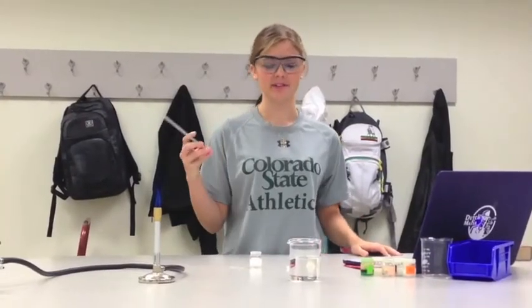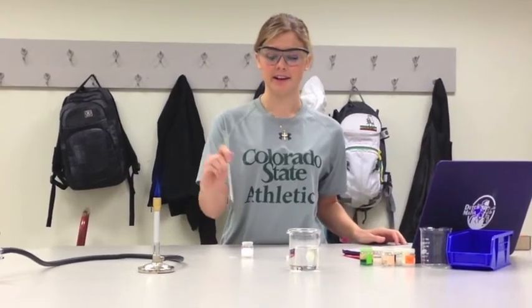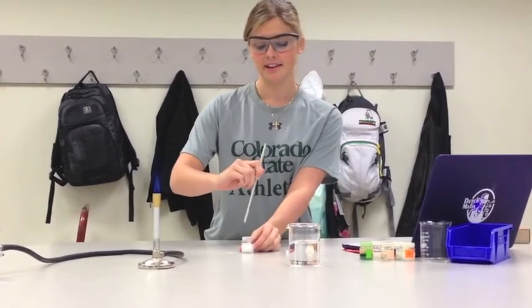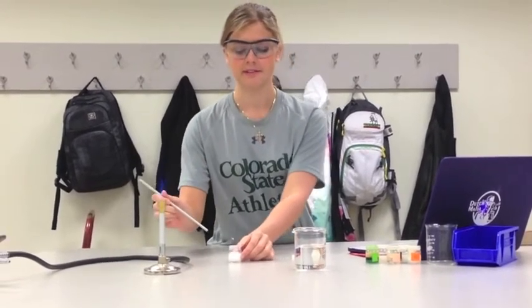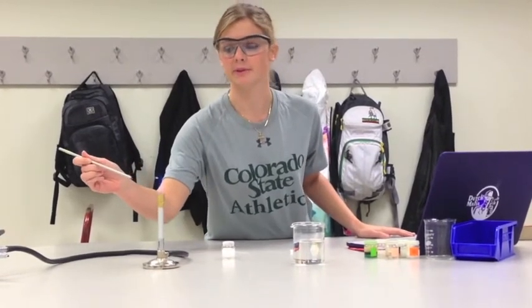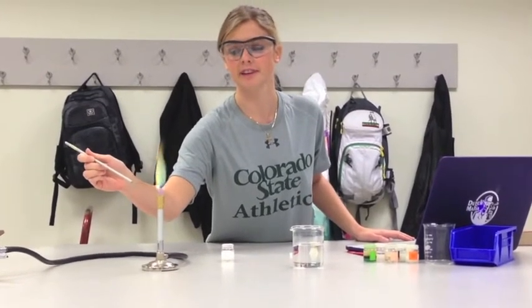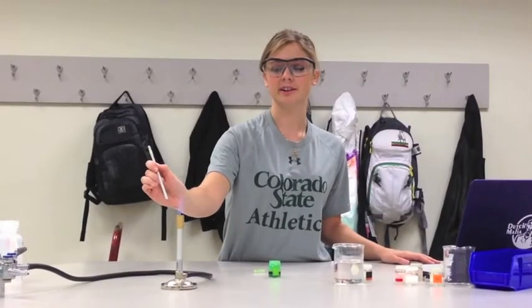Once your wire is cooled down, take your unknown salt and dip your wire into the unknown salt. Make sure to get it as best coated as you can so you can clearly see the color in the flame. Once your wire has salt on it, put it in the middle of the flame and observe the color. From this, you should be able to determine the color of the flame and which compound is in your unknown salt. If you're not observing a color, reapply your salt.